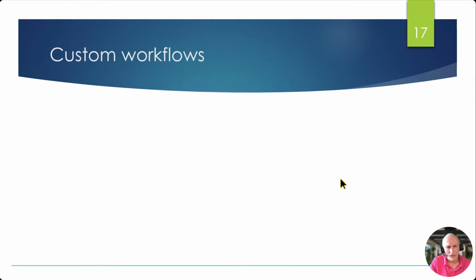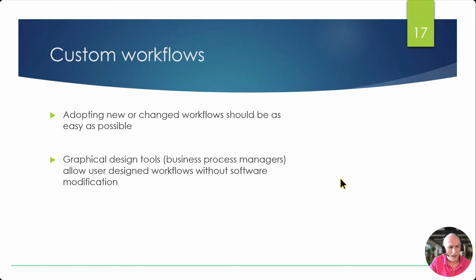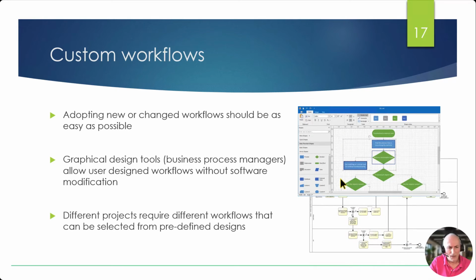Custom workflows. Adopting new or changed workflows should be as easy as possible. Graphical design tools, business process managers, allow user-designed workflows without software modification. Different projects require different workflows that can be selected from predefined designs.